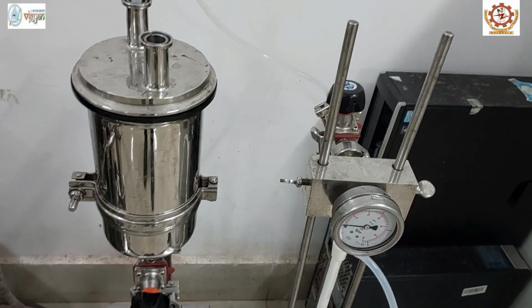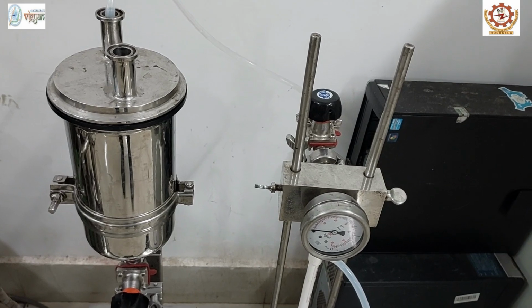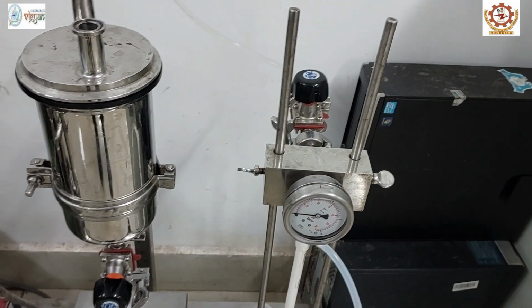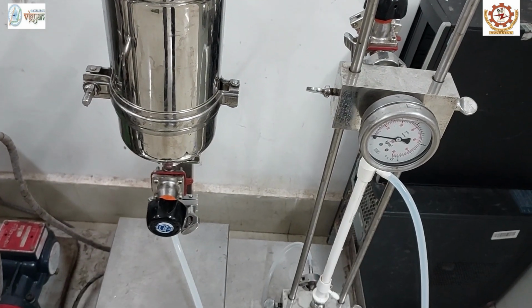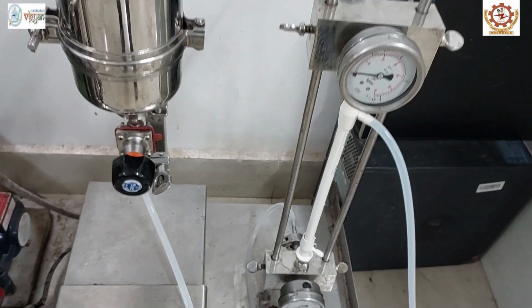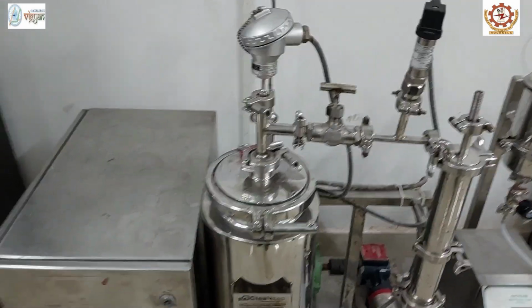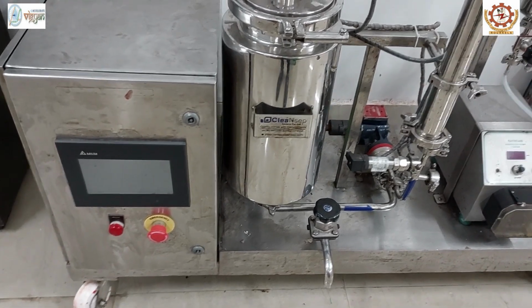Like microfiltration, ultrafiltration membranes are usually made using hydrophilic materials such as polyamide, polyether sulfone, polycarbonate, cellulose esters, polyether amide, polyether ether ketone, and polysulfone. As I have already said, the other part of the membrane filtration system is used for nanofiltration and reverse osmosis techniques.